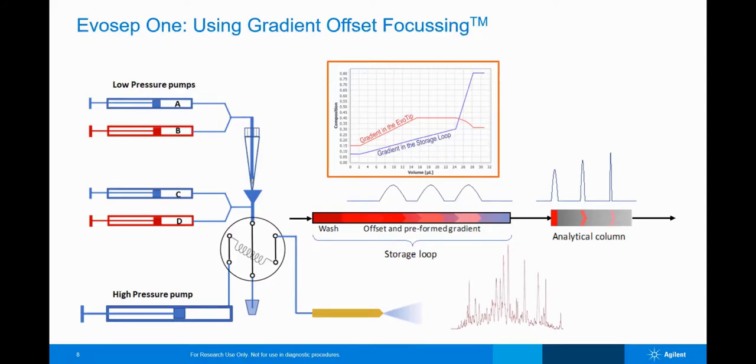So integrating the elution can reduce the injection cycle overhead, and it will retain the contaminants on the Evotip cartridge, which will be disposed of after each injection. Since all the elution and gradient formation happen at low pressure, they can minimize wear and tear.